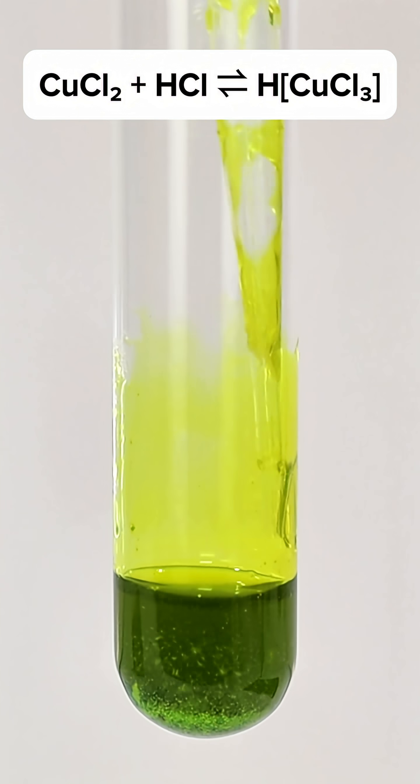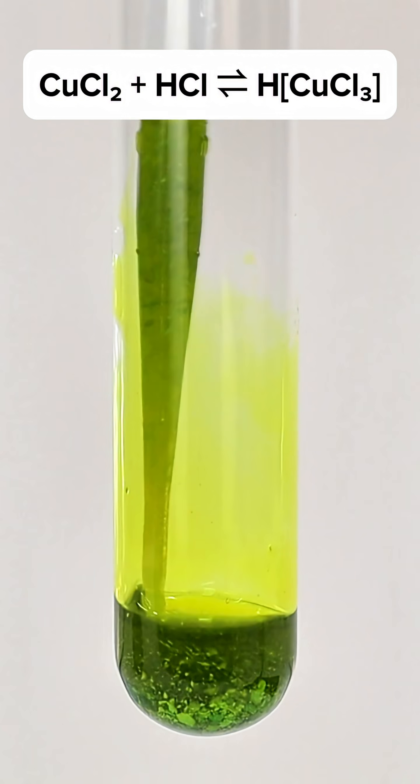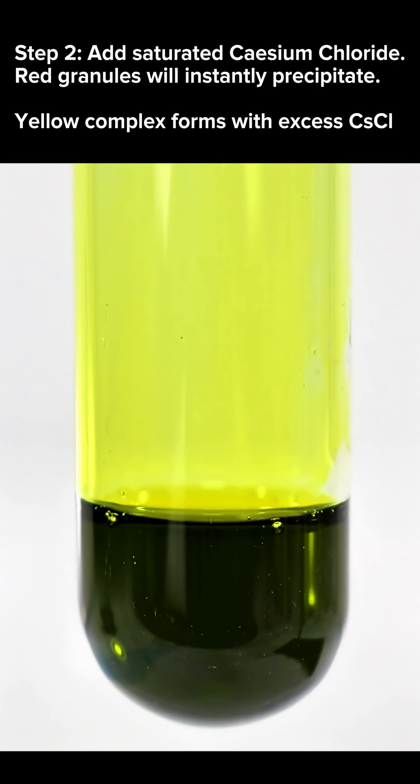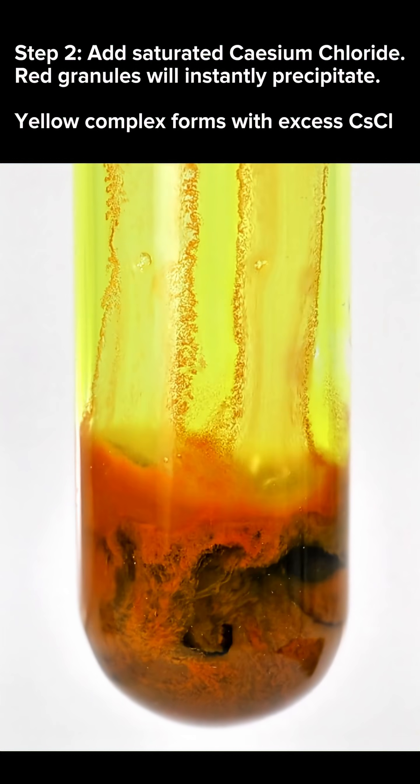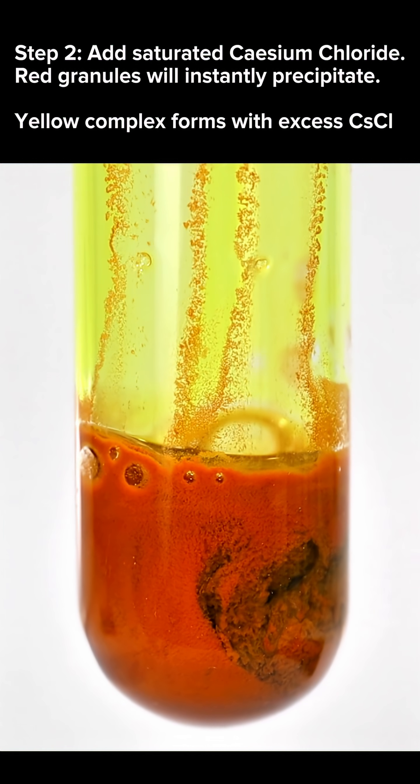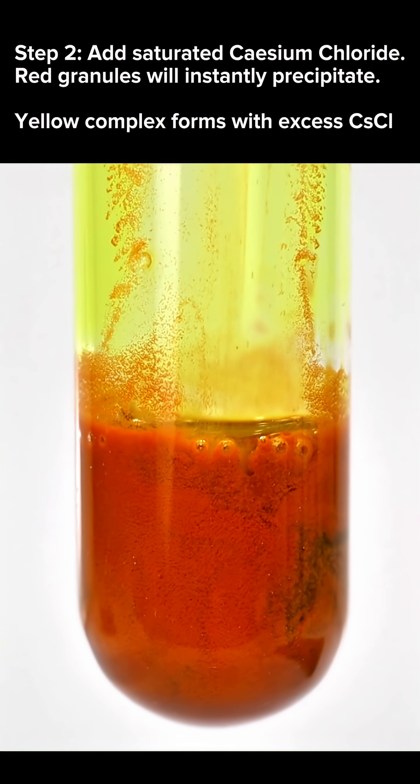This will form a complex with the copper chloride, which is a very distinct olive green color. At this point, all I do is add some saturated cesium chloride, which will immediately begin to form a dense red precipitate.